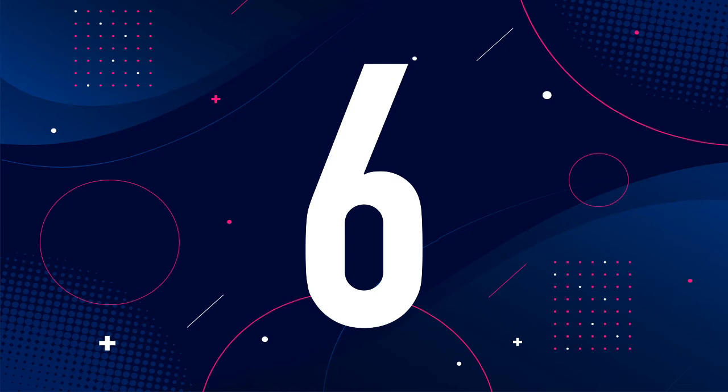Now, one thing I do want to let you guys know is as we keep moving through our class, remember we're viewing bacteria. So when you're viewing things at that 4, 10, and 40x, you're really not going to see the cells. They're still too small. We can see like the dye, but we have to go to the 100x to actually see the cells.